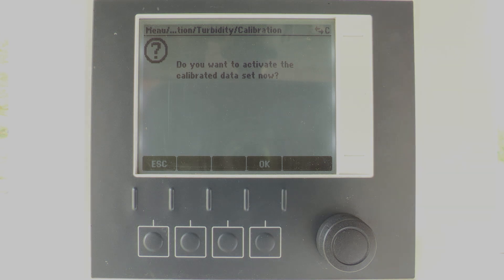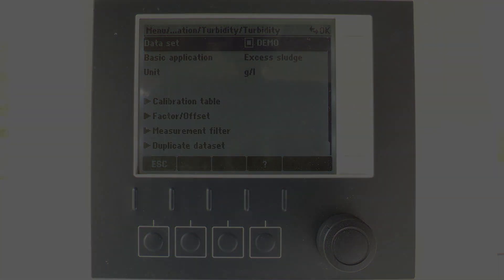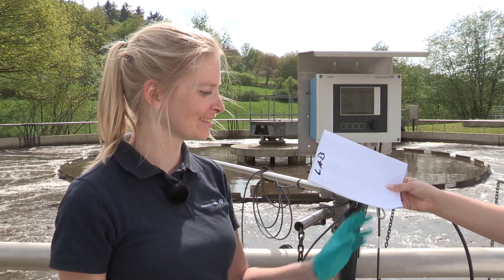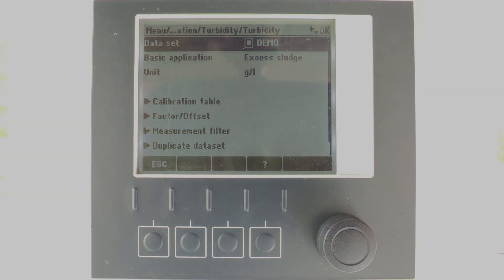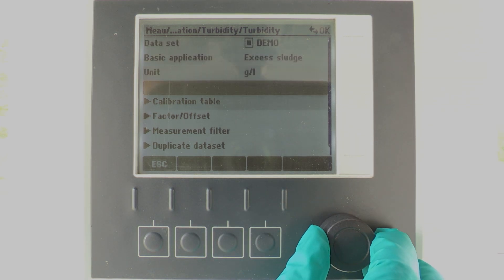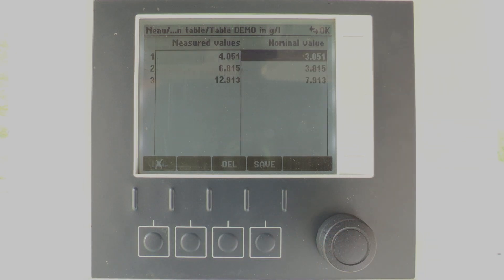However, due to the missing lab values, our dataset is not ready for activation, so here we press escape. Here are the lab results — let's go on. To complete the calibration data set, we go to calibration table, edit table, and enter the lab values in the nominal value column.